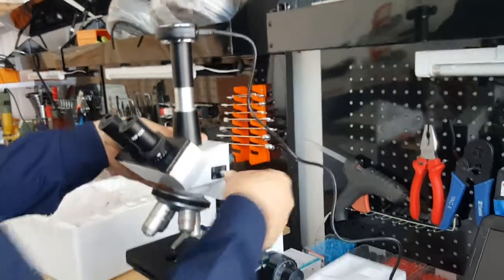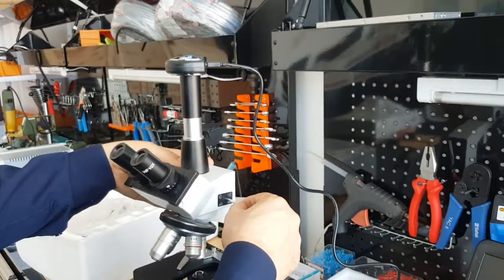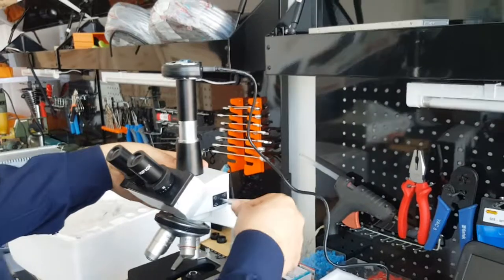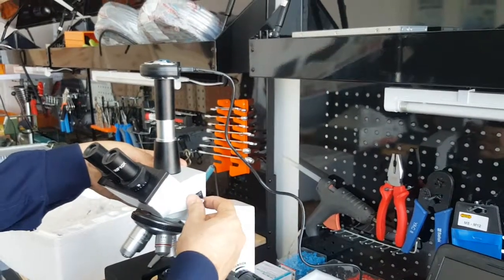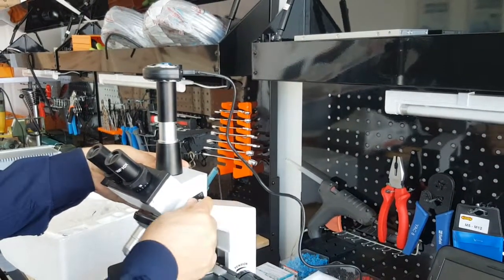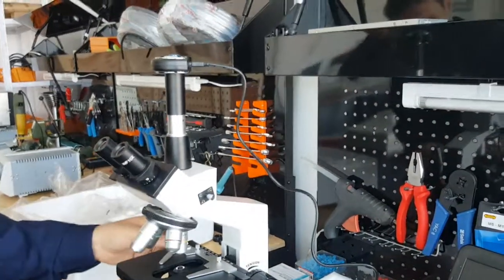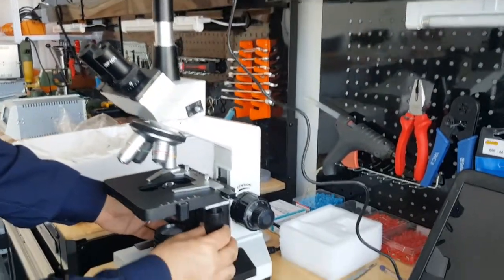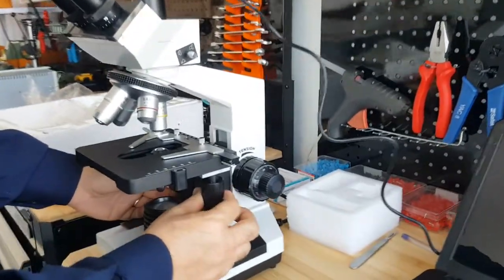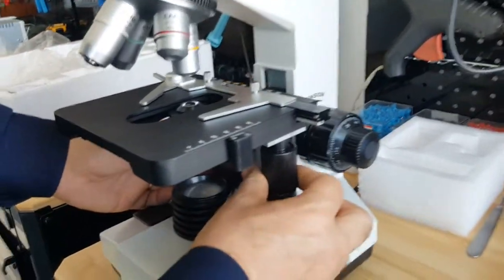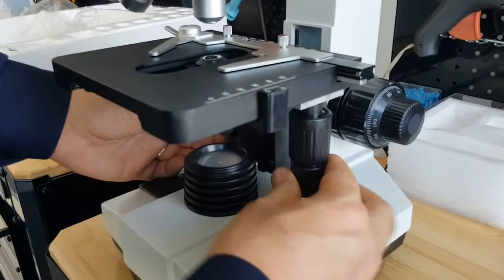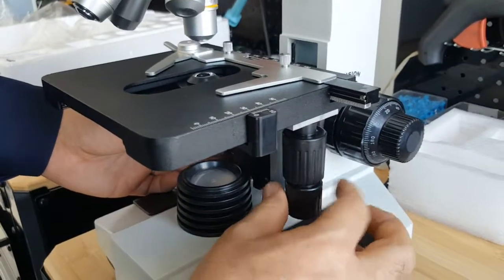We can close it, we can open it, the neck for the eyepieces. We have here movement of the table in two directions, XY, like this.